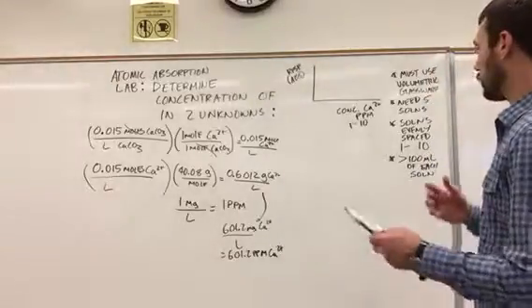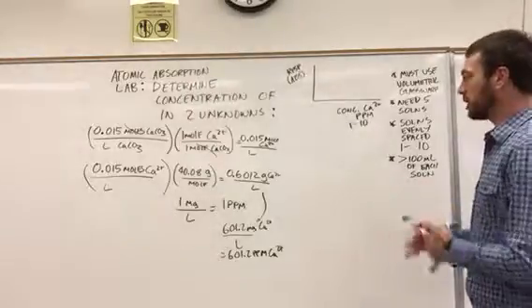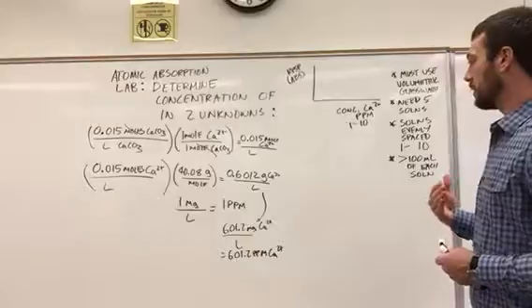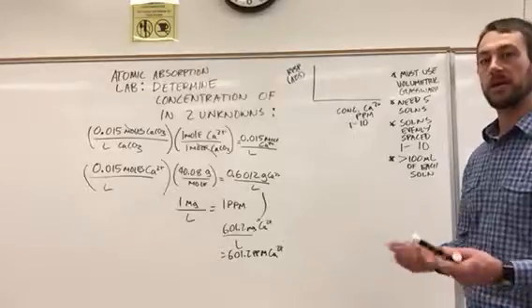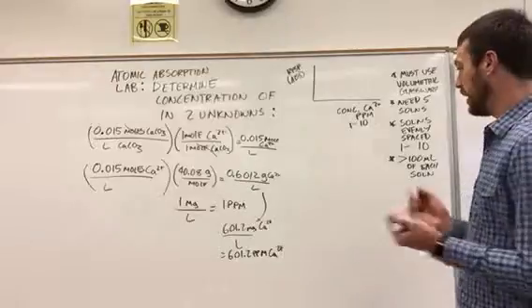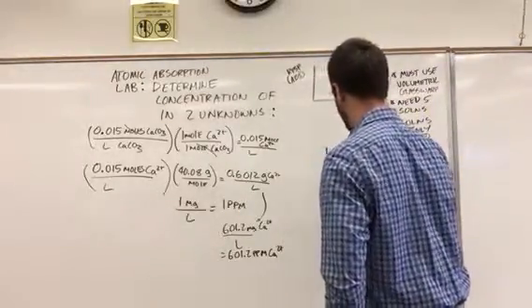So we're going to use a standard M1V1 calculation to do this, but you can use a chart to help you determine which are going to be the 5 concentrations that you need. The way that you make this chart is by drawing a grid.